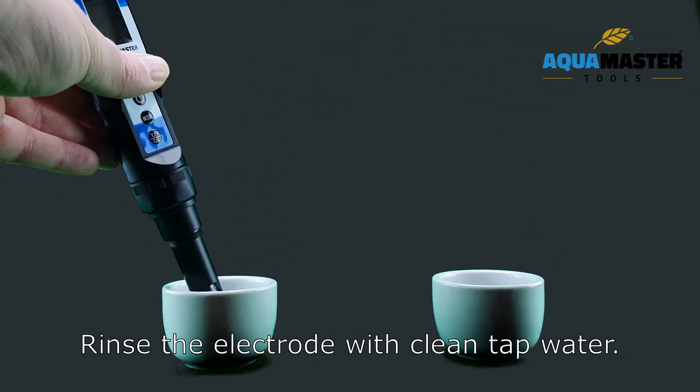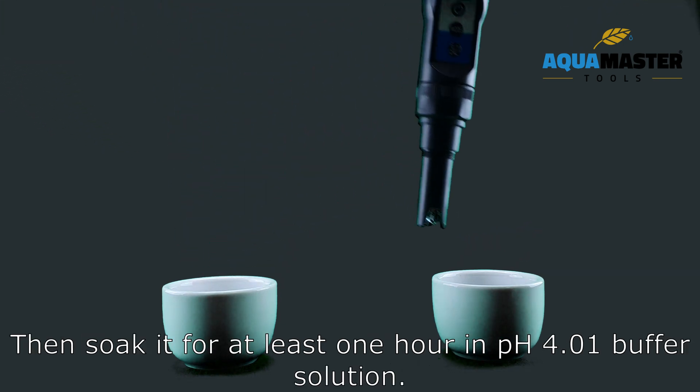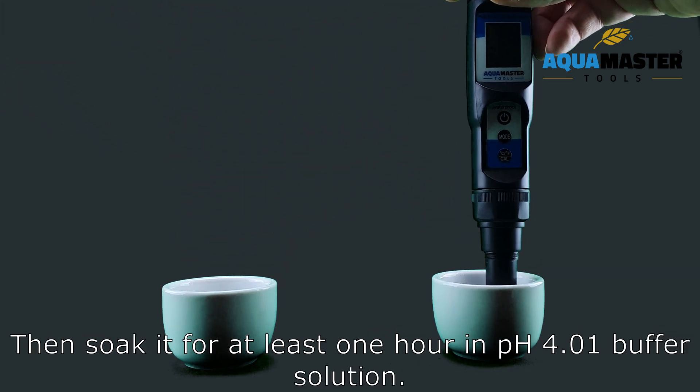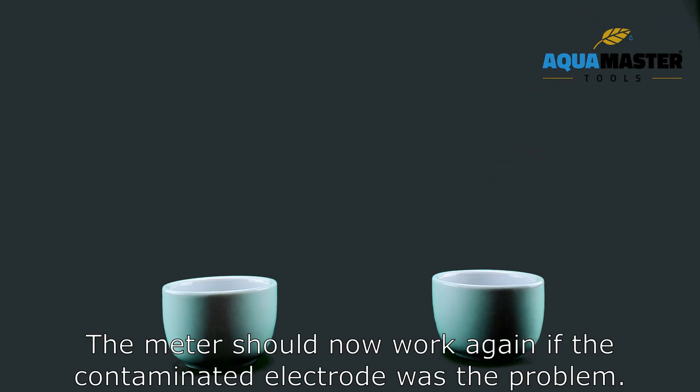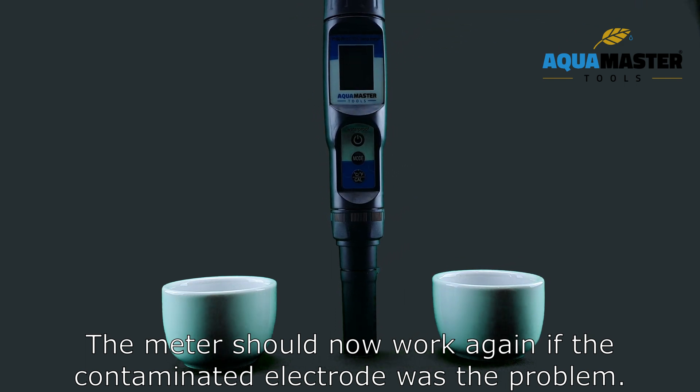Repeat the cleaning process until the electrode is thoroughly clean, then rinse it with clean tap water. Soak it for at least one hour in PH 4.01 buffer solution. Rinse with tap water and recalibrate the meter. The meter should now work again if the contaminated electrode was the problem.